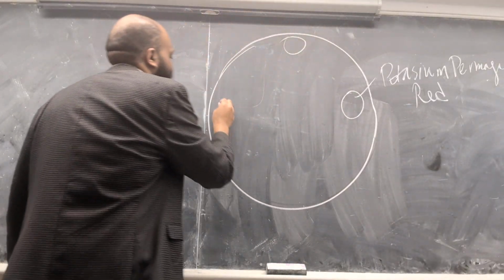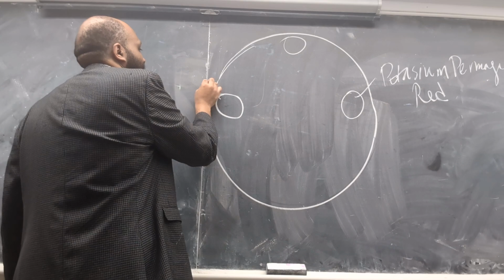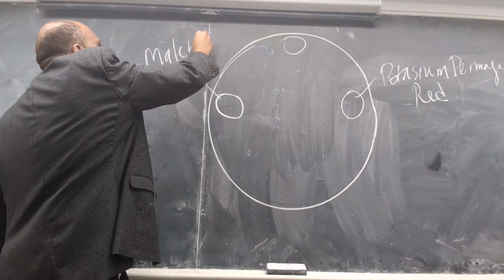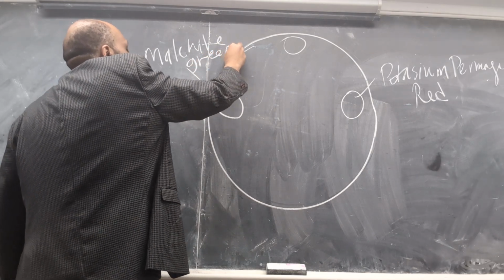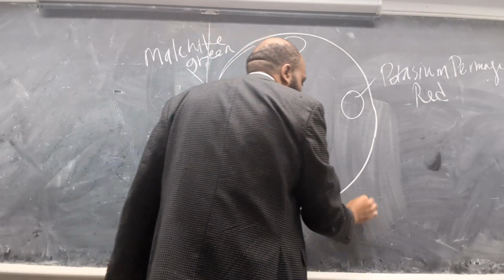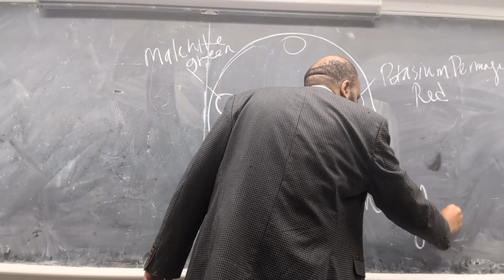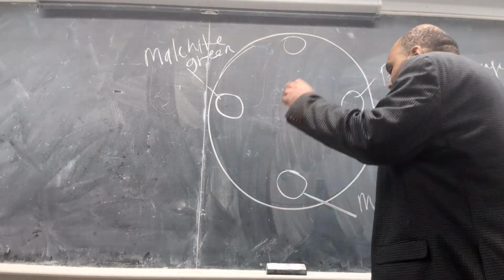On the west, we're gonna have another hole, and in this hole we're gonna put malachite green. And on the south, we're gonna put in this hole methylene blue.